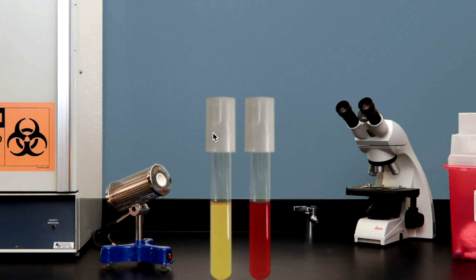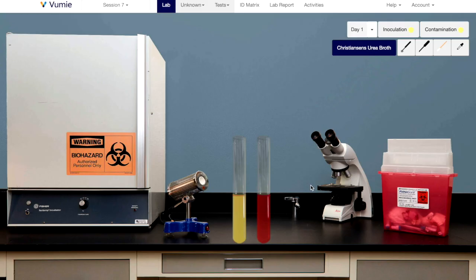Place the cursor over the cap of the inoculum tube and click to bring up the action menu. Select toggle caps and lids or a double click will do the trick. The caps and lids will be removed.